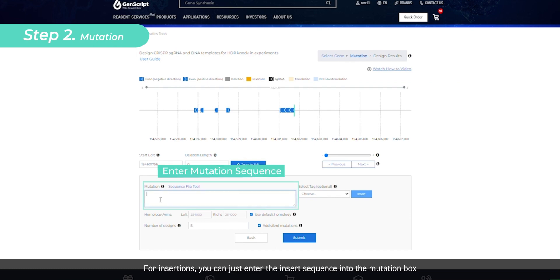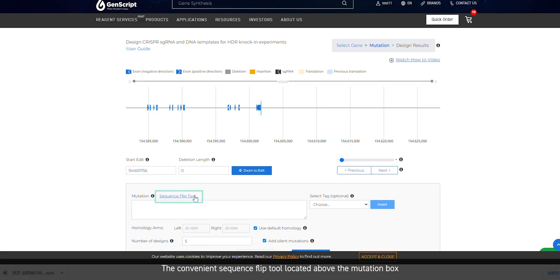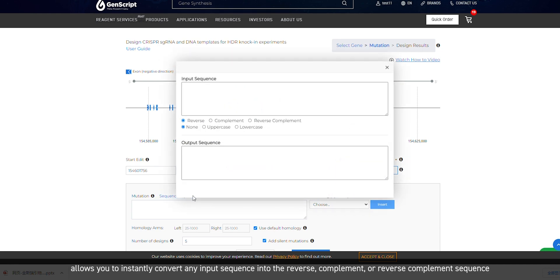For insertions, you can just enter the insert sequence into the mutation box. Single base changes can be made by simply clicking them. The convenient sequence flip tool located above the mutation box allows you to instantly convert any input sequence into the reverse, complement, or reverse complement sequence.